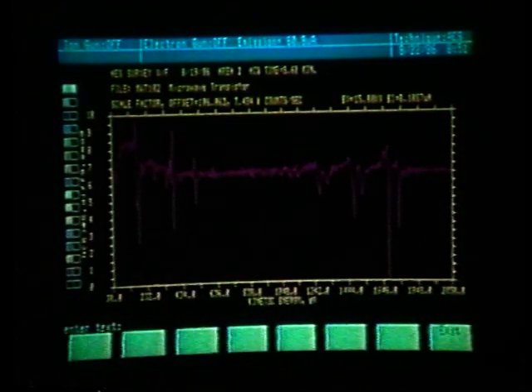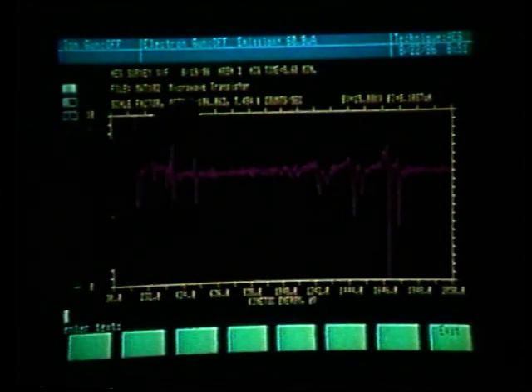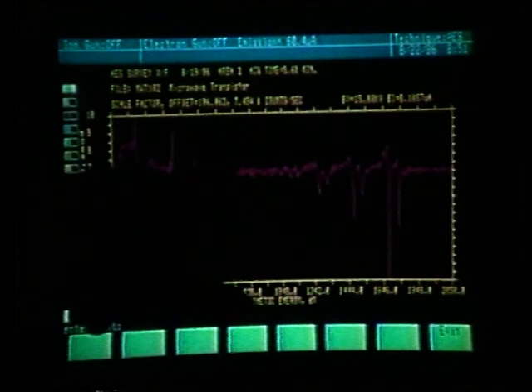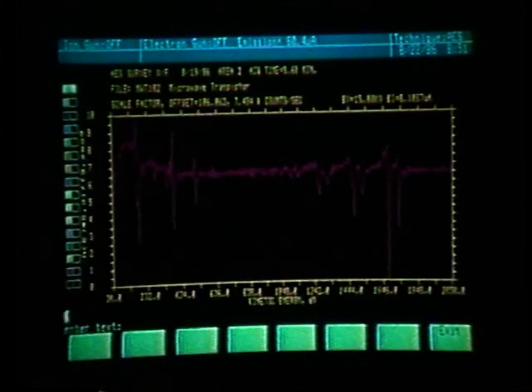Entering a text, let's be a little bit more explicit on this area. We already have the comment microwave transistor, and it already tells us the area, but I would still like to put that on the graph. It would make it easier for me to very quickly, looking at the graph, determine the sample and the area where this analysis was acquired.